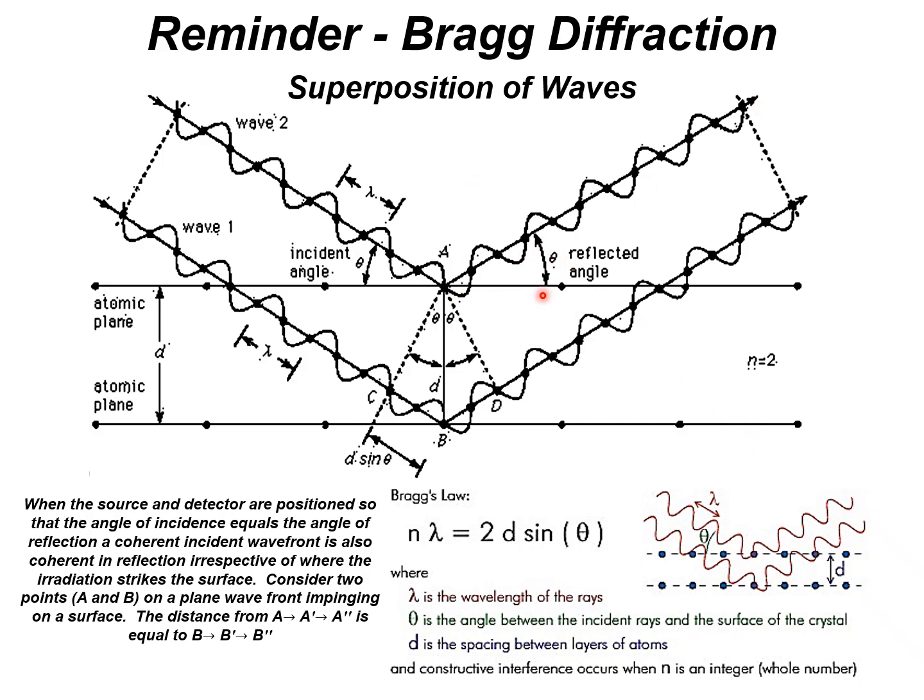Plus the angle is such that it has a certain geometric relationship with the scattering from atoms in each plane or in separate planes, such that the phase difference, 2d sine theta, gives constructive interference. Now that phase difference can be some multiple of lambda: 1, 2, 3, 4.